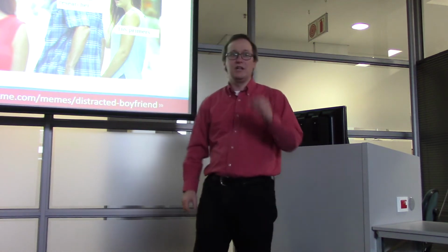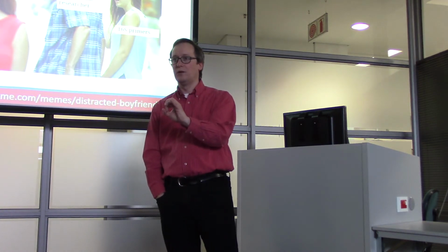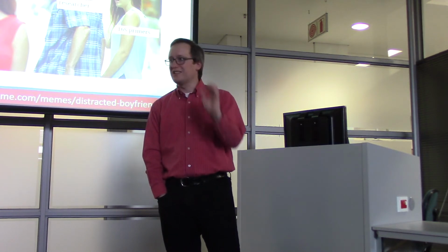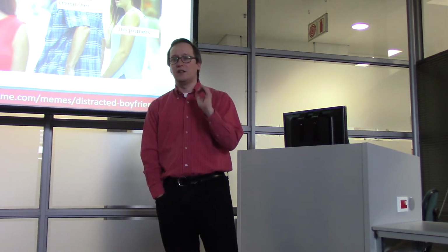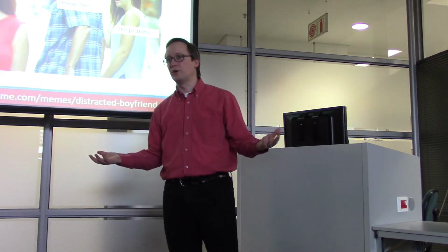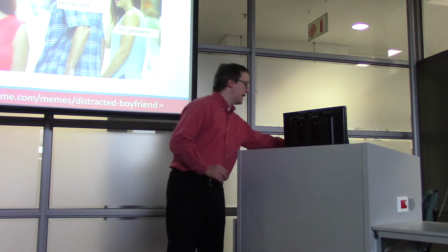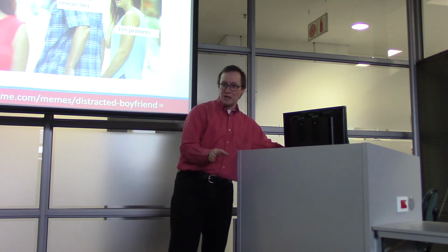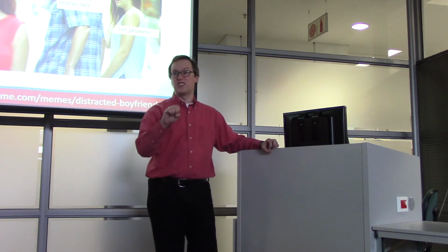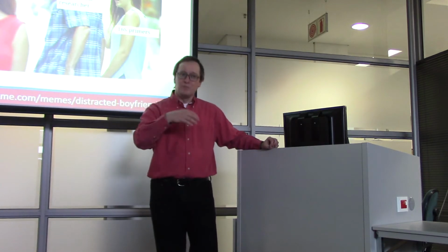And I want to point out that if what you care about is which species are present in this sample, going after the more narrowly targeted 16S sequencing makes your data more interpretable than if you simply have a hugely diverse collection of proteins or of genes from all these different species. So don't be distracted. Focus on tools that you know work. Don't be caught up in thinking that your life will get better if you just do something that's newer. If you don't really know how to take advantage of the data from the newer technique, you may be safer going with the old.